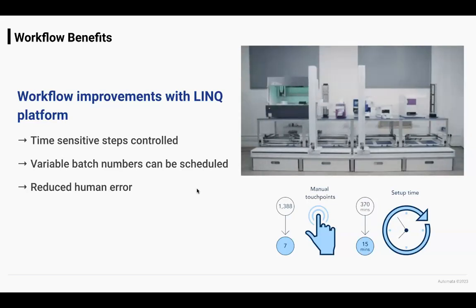So things like time sensitive steps can be controlled. So adding a dye, as soon as you add that dye to your sample, you might want to move it to the plate reader as quick as possible, so it can incubate in there rather than out in the open. If you're not in the lab at the time and you're doing this manually, or on a liquid handler and you're not there to move it over, you can get some inconsistency of how much light it's exposed to. But here, as soon as it's ready, we're going to move that plate and put it into the dark plate reader.